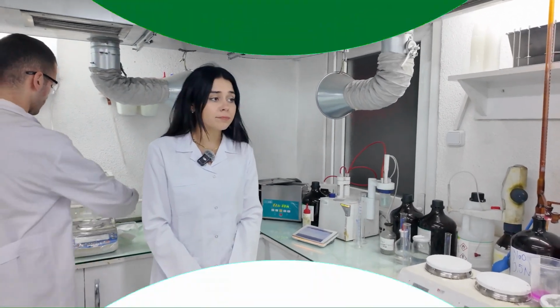Mr. Musa just checked the viscosity and liquid density of our liquid sample in the quality laboratory. Now he will check its moisture content. As Mr. Musa observes them, I will take a moment to explain the devices we use for quality measurements.